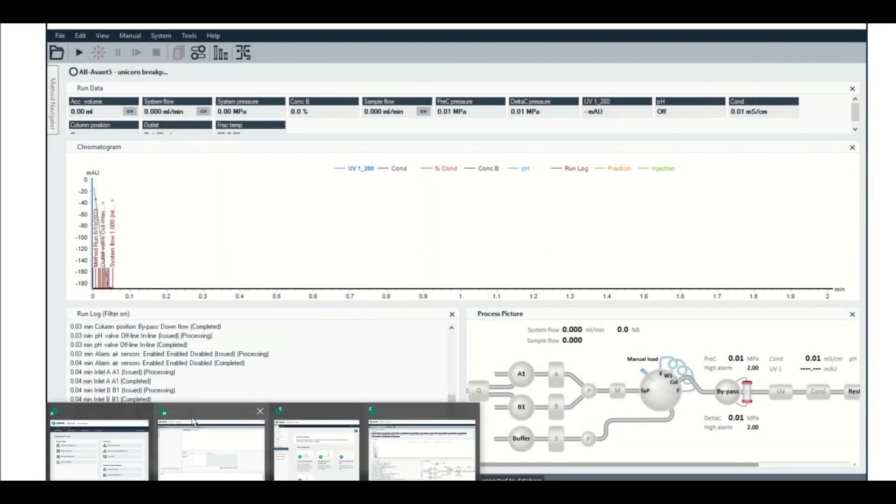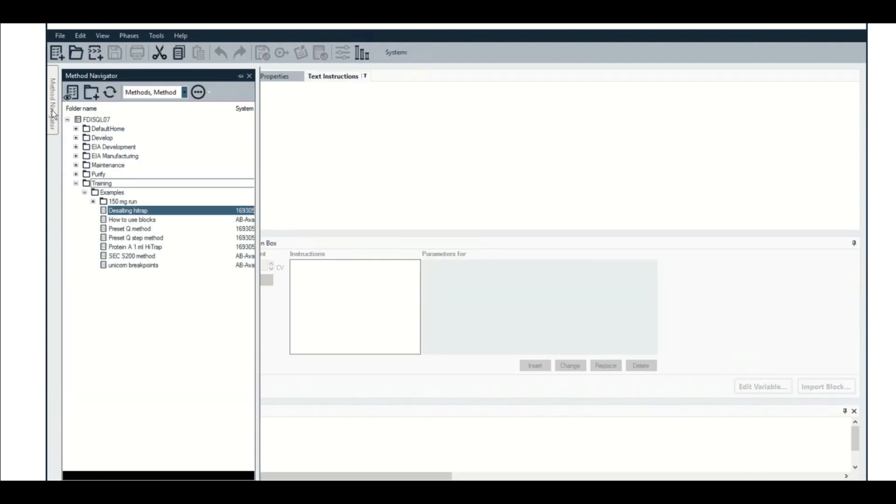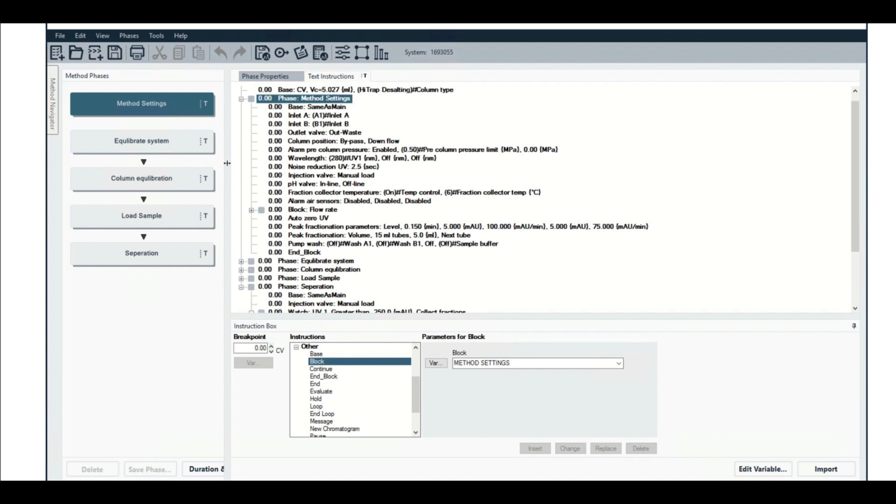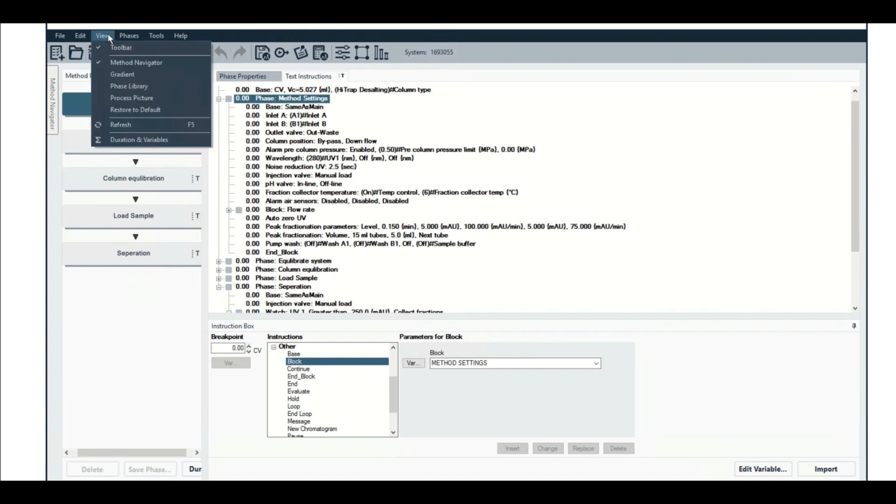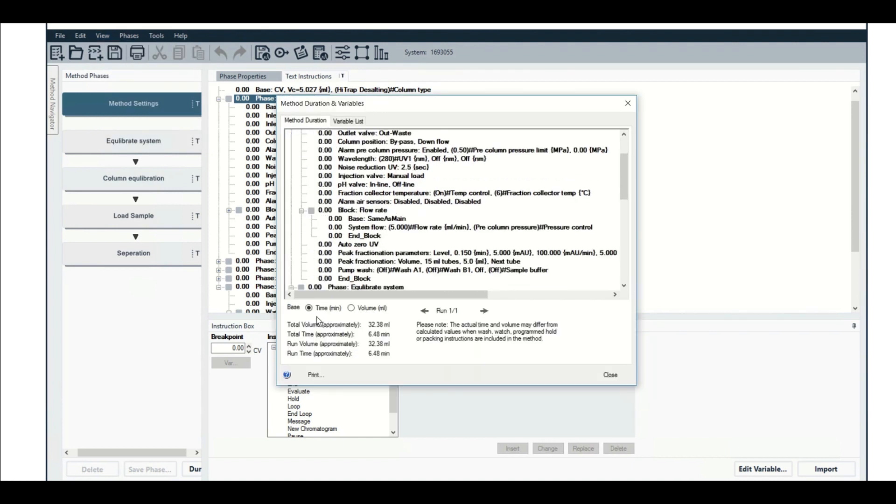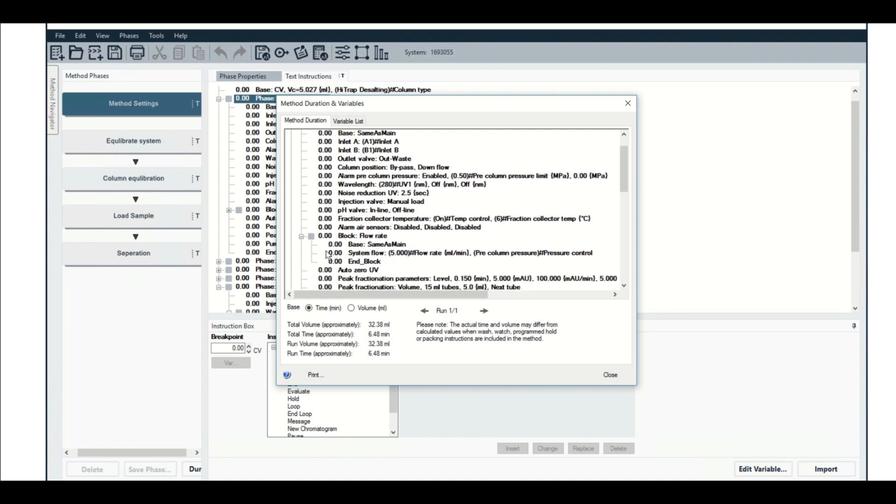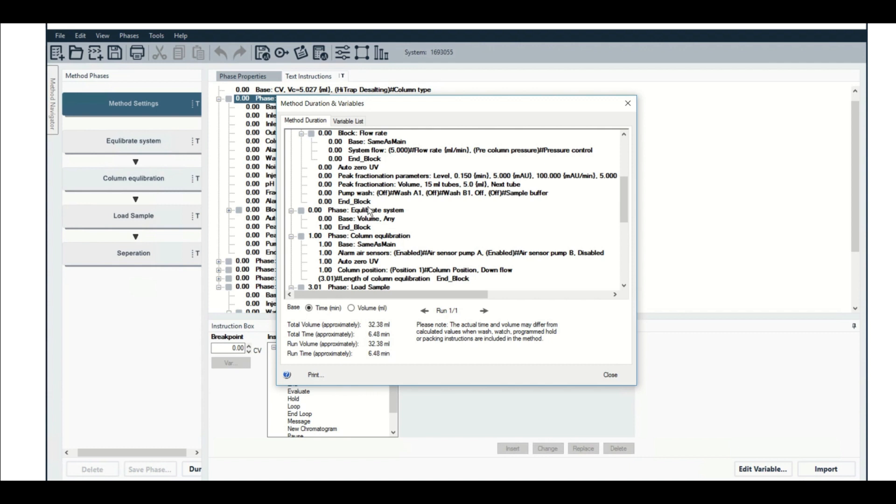So here we are in unicorn. In order to see the duration and variables view, we have to go into the method editor. We're going to open this desalting high trap method, which I've probably have used so much I'm starting to mess things up. I'm going to get rid of this view here so we can just really see things kind of stretched out. Okay. So we're going to go to view and then duration and variables. So here it is. We can see that we're currently looking at base of time right now and more or less the method settings phase. All this should happen at once. Same with the flow rate. The end block should all be read. The first thing that's going to slow us down is this equilibrate system, which is going to be in terms of volume. It's going to be for one mil is what it looks like, which is kind of small. That's not even the volume of the mixer, which is kind of one of the reasons we need to be aware of the Avant flow path.